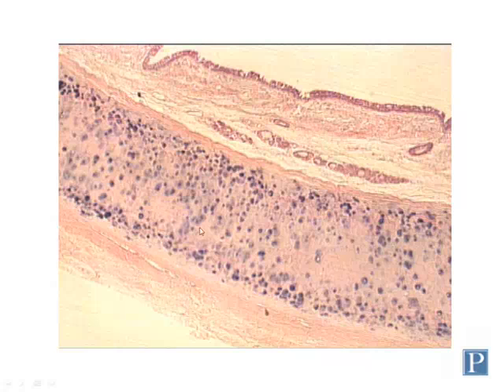It differs from other connective tissues in that the matrix is solid and tends to have a very homogeneous, glassy appearance. Most types of cartilage have a different type of collagen, type 2 collagen rather than type 1 collagen, giving the matrix a much more smooth, homogeneous, or glassy appearance.